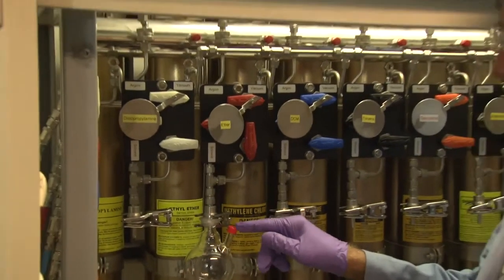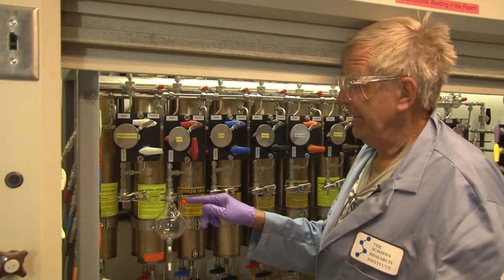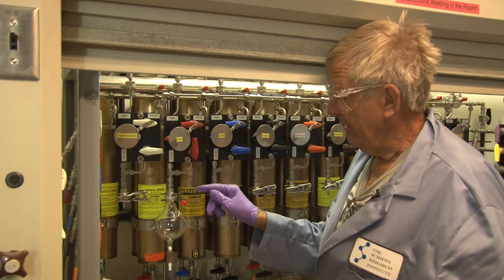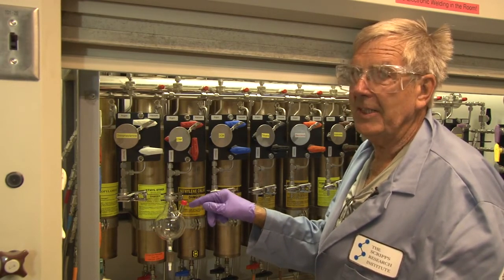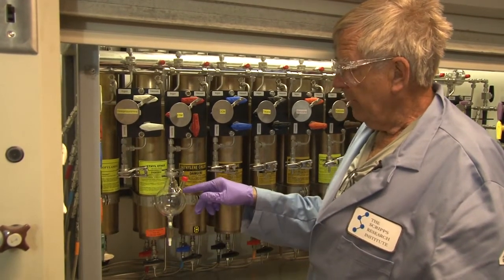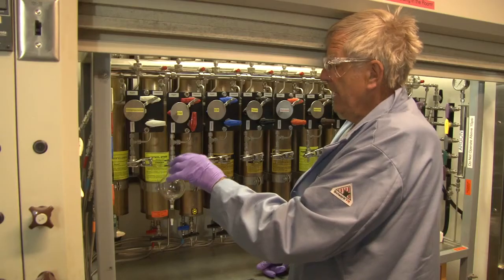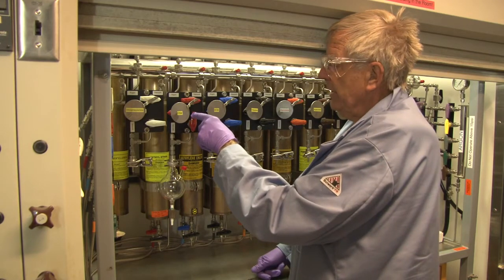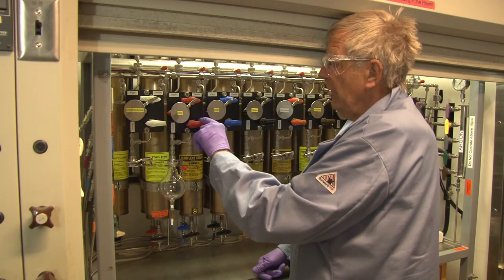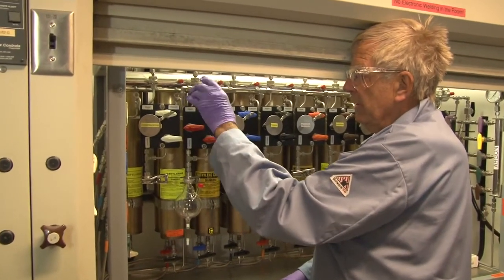These septa are suitable for multiple hole punches. However, it is prudent to replace them at regular intervals depending on the number of holes. If you want to discard solvents, you simply put the bulb on argon pressure and open the drain valve. When you are finished evacuating the bulb and ready to take off solvent, you always close this valve and always switch this over to argon.